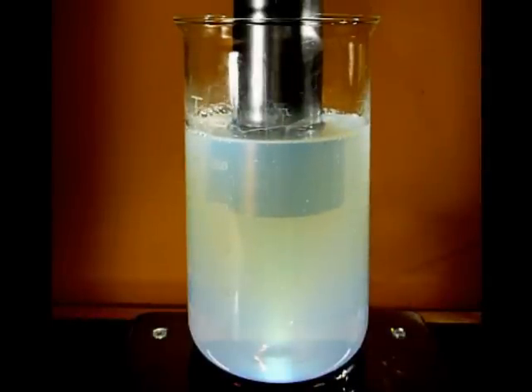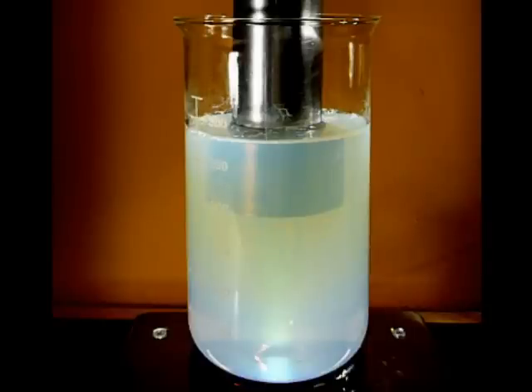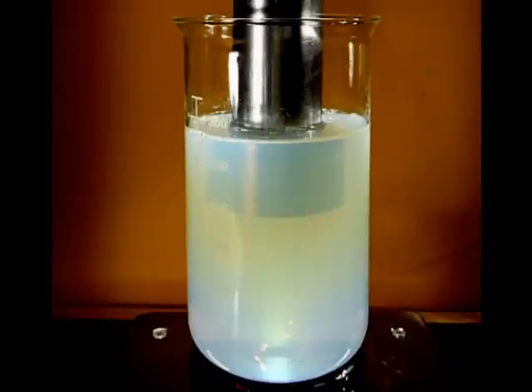As you can see, once again the liquid has become translucent, meaning we have successfully demonstrated our ability to scale up ultrasonic processes by using barbell horns. Industrial versions of this equipment can have a further scale-up factor of 5 to 6.